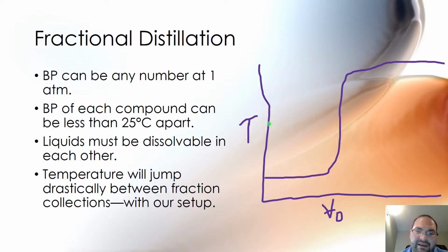The BP, or boiling point in this case, not blood pressure, doesn't have to be 25 degrees Celsius apart. It can be very, very narrow.